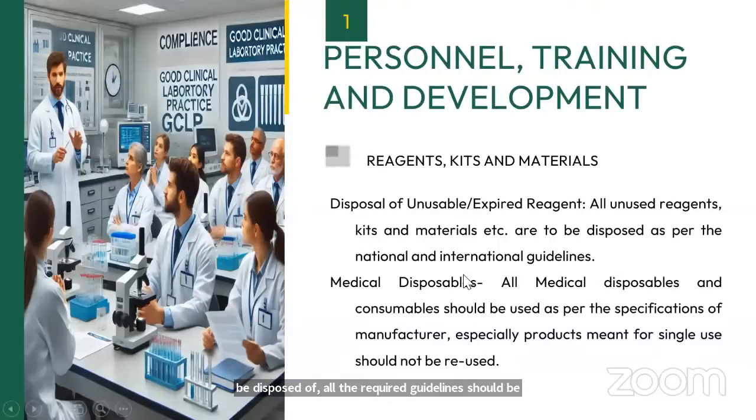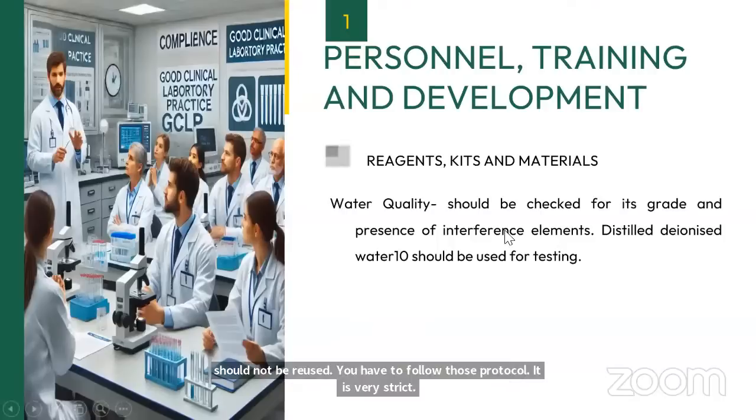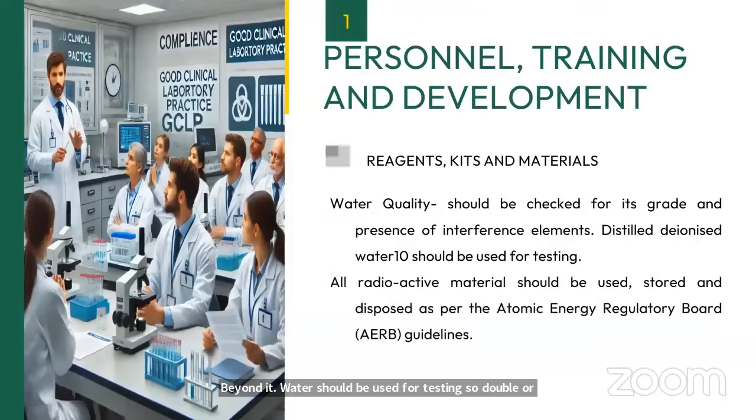All the medical disposables and consumables should be used as per the specifications by the manufacturer, especially products meant for single use, which should not be reused. So needles and syringes should not be reused. You have to follow those protocols. It is very strict. Water quality should be checked for its grade and presence of interference elements. Distilled deionized water should be used for testing. So double distilled water or deionized water should be used in your laboratory as and when required.